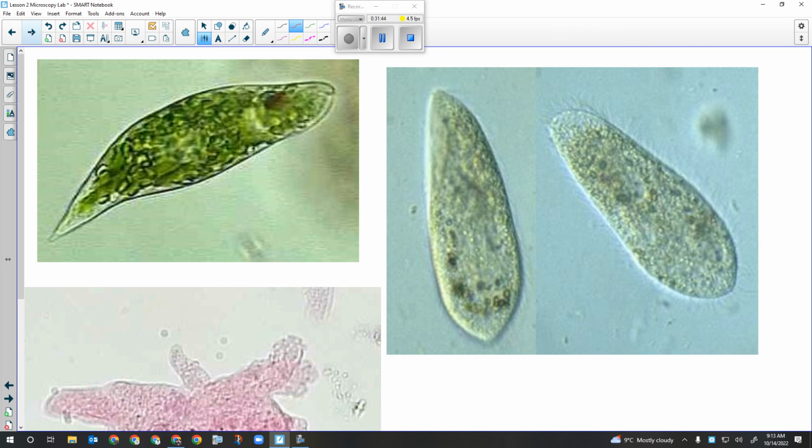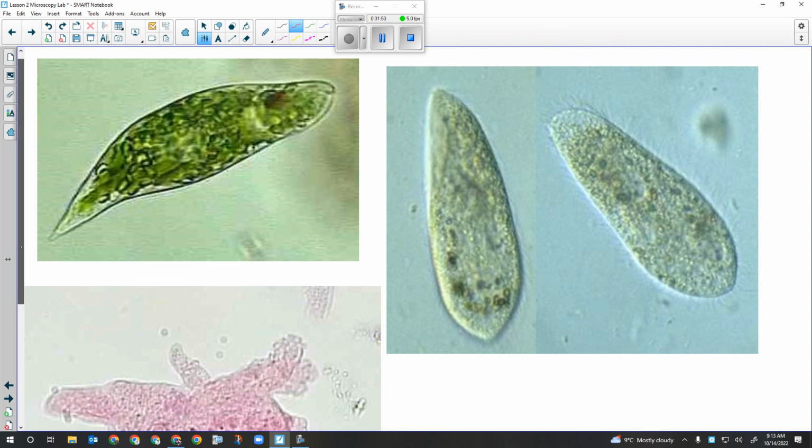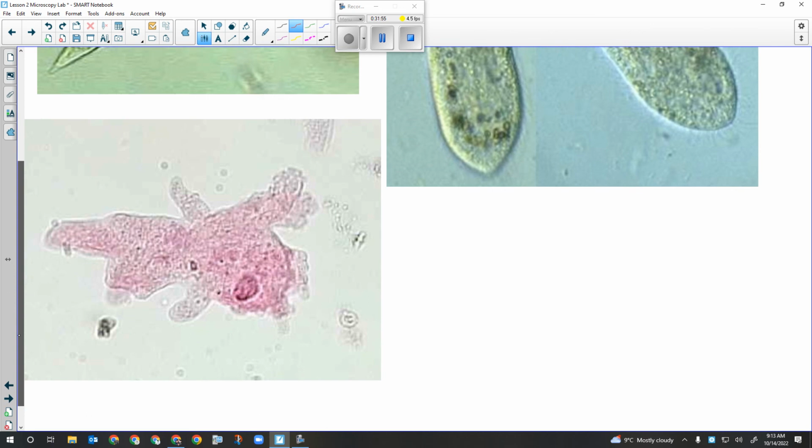Okay, so these are the specimens that you're going to look at. I apologize, the resolution didn't upscale on the new board. So your amoeba, depending on what slide you get, we have slides from different manufacturers of the amoeba, and so they're stained differently. Most of the slides, the amoeba is going to appear a light blue color, with a kind of a pink nucleus and things like that. And there's a few of the slides that will have this stain where it's more of a pinkish purple.